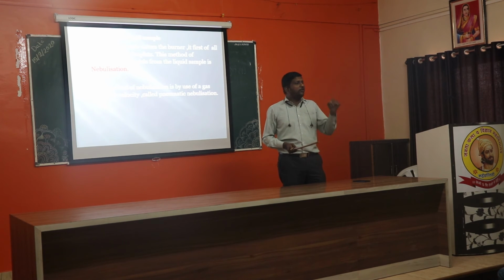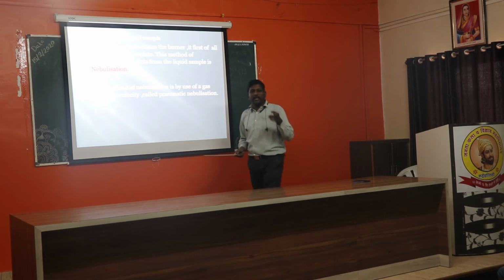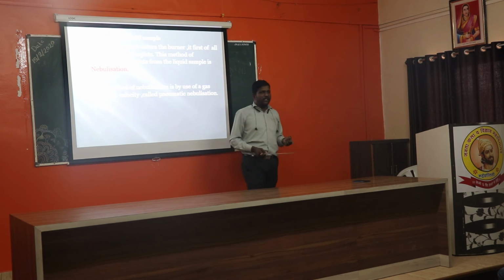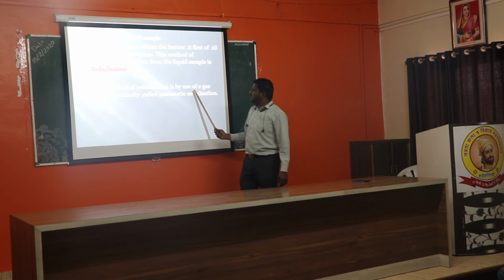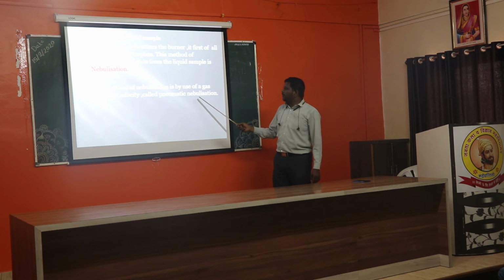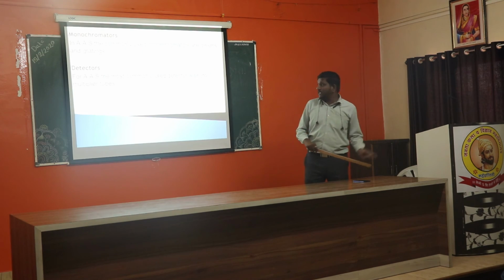Conversion of the sample solution into small droplets. A common method of nebulization is by use of gas moving at high velocity, called pneumatic nebulization.